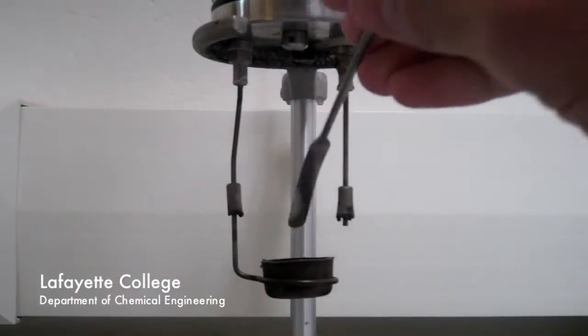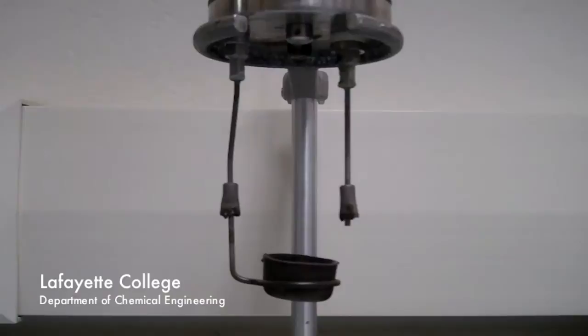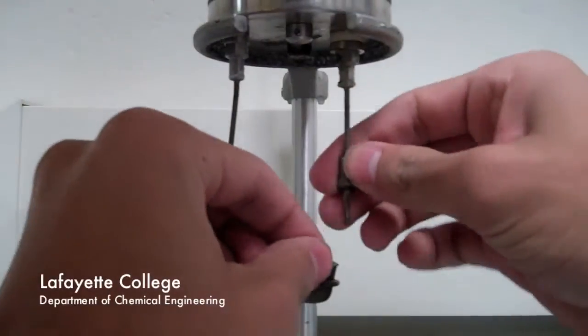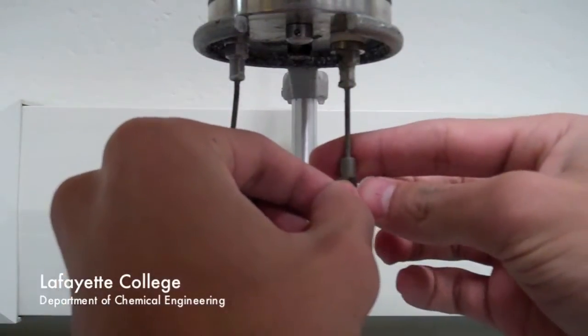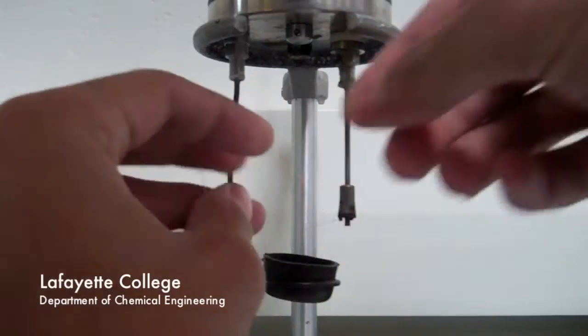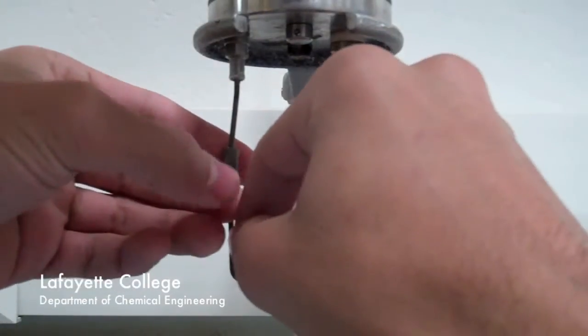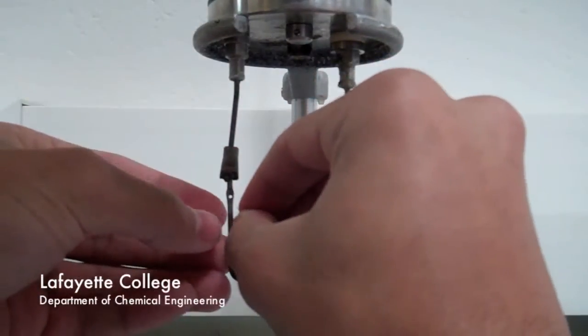Next, place your mass sample inside the sample bucket. Cut a 10 cm long fuse wire and attach it to the metal arms as shown. Lift up the clamps, feed the wire through the holes, and lower the clamps on top of the wire.